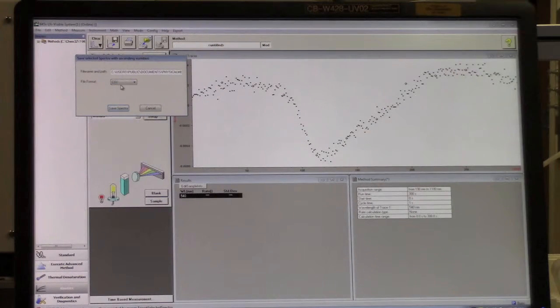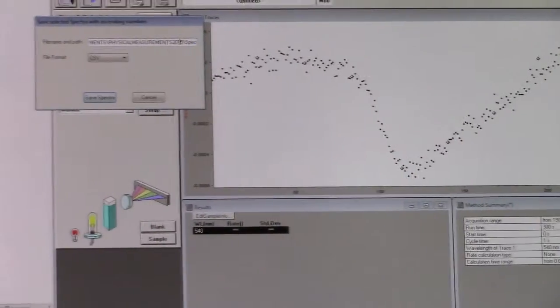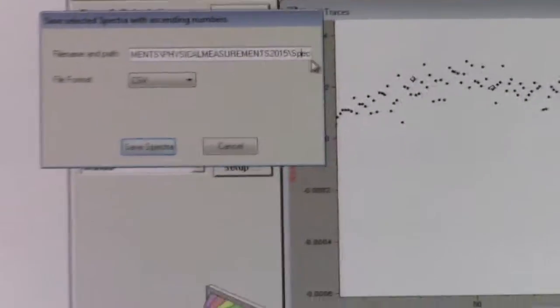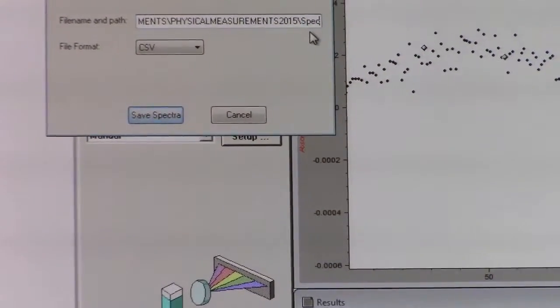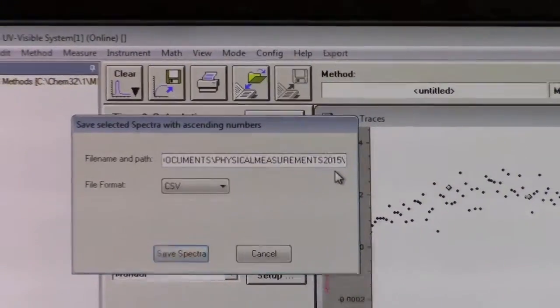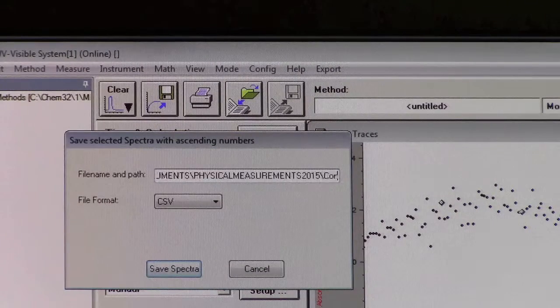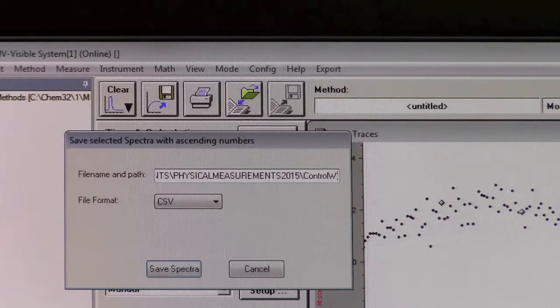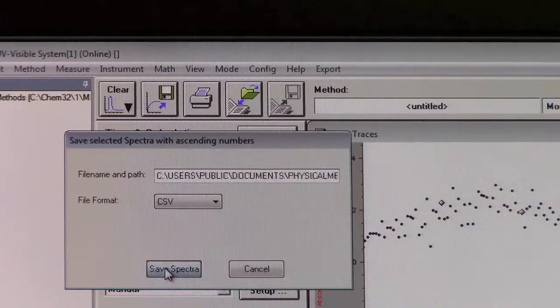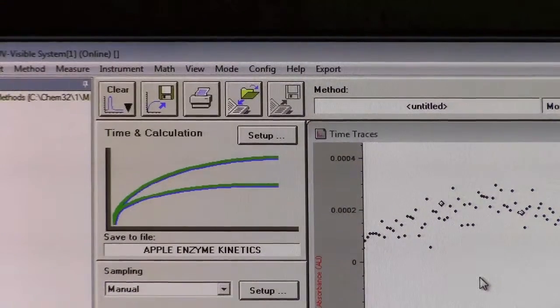Choose the file format as CSV and check the path. The path should already be set to the appropriate location. At the very end, you can name the particular trial. In this case, let's say it's a control without enzyme. Click Save Spectra, and it is now exported as a CSV.